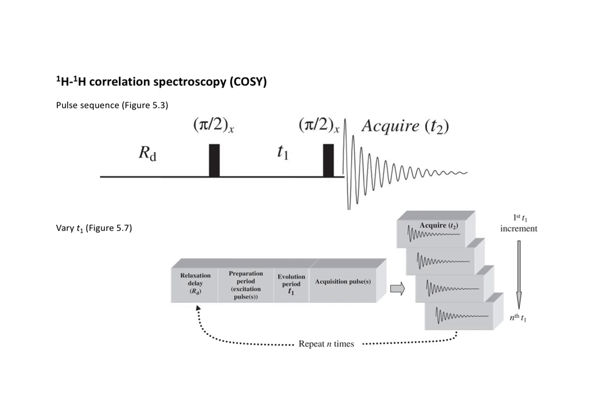This video focuses on strategies for interpreting structural information by adding proton-proton correlation spectroscopy to the other data that's been described so far in these videos. The acronym COSY typically refers specifically to the proton-proton correlation spectroscopy experiments, although there are many other types of correlation spectroscopy.